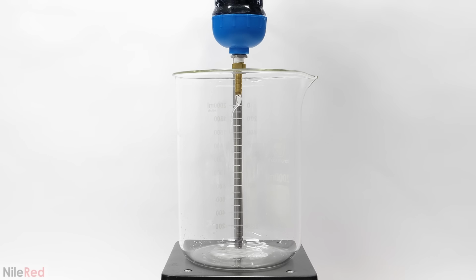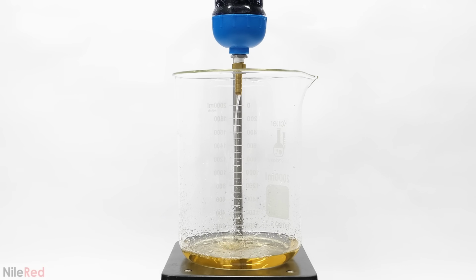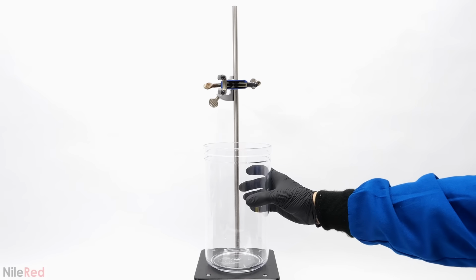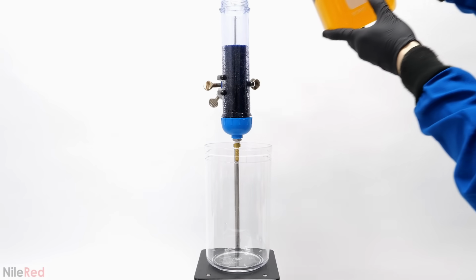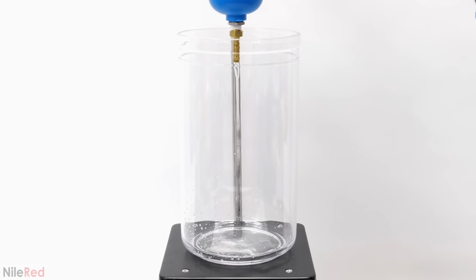As it passed over the resin, it pulled out anything that was charged, and this included things like acid and salts. The sugar itself, though, was a neutral molecule, and it shouldn't have been affected by it. It even got rid of some of the color, and after just one run, it was looking a lot lighter. I then swapped out the beaker for another container, and I passed it all through again. I was doing this just to really make sure that I pulled out as much junk as possible.